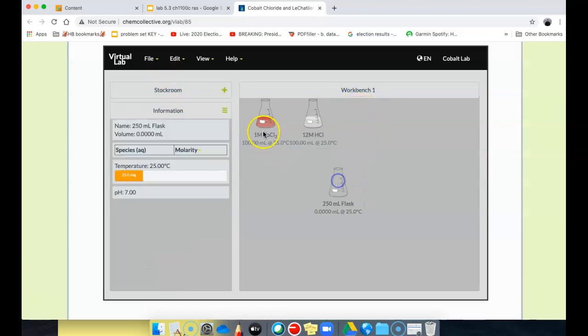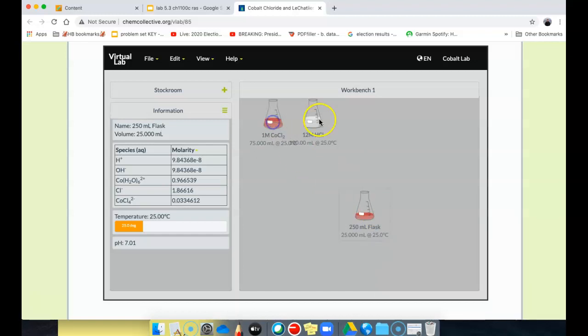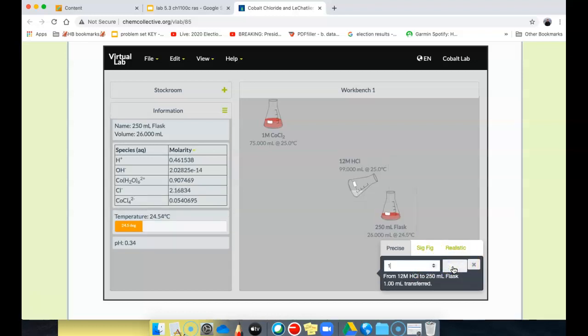Fine. And first, let's pour 25 mils of this into there. Done. And let's pour this in 1 ml increments until it changes color. Now, I already did this, and it changes color slowly. There's going to be a lot of different answers here, because watch what happens. That's 1 ml. See how it went up to 26, 27, 28, 29, 30. Now, I'm already seeing it changing color. But it hasn't really turned a real color, so why don't I wait until it turns maybe bluish?